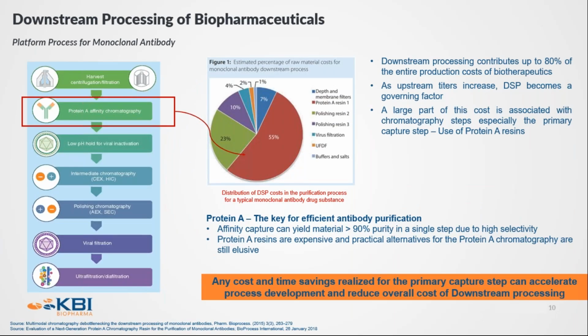Now, within the biopharmaceutical space, monoclonal antibodies occupy a very important space. And that is the reason why I'm going to focus my talk on monoclonal antibody purification today. For monoclonal antibodies, the downstream purification contributes quite significantly to the overall cost of drug manufacturing, and we are always in a quest to reduce these costs as much as possible.